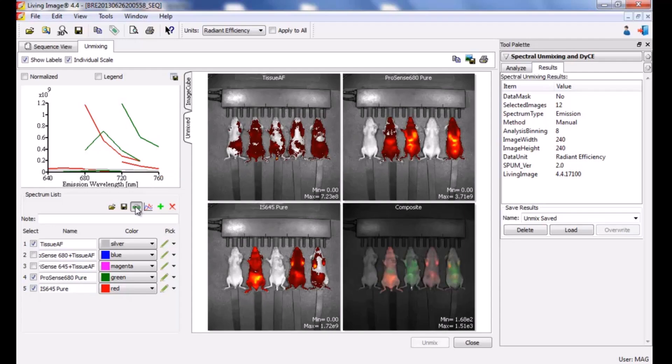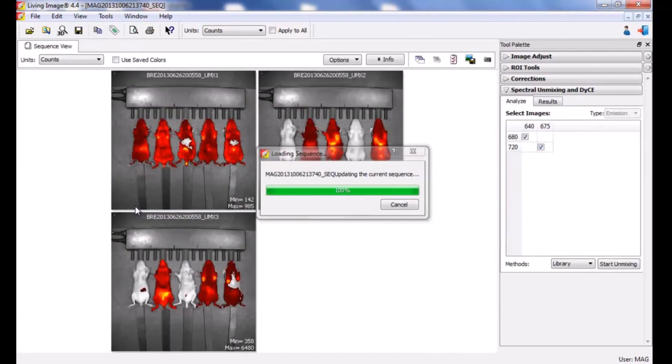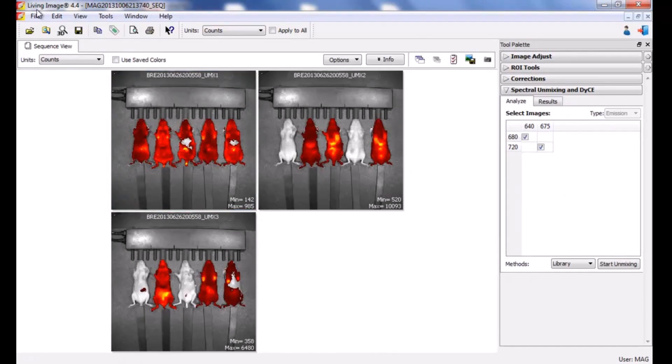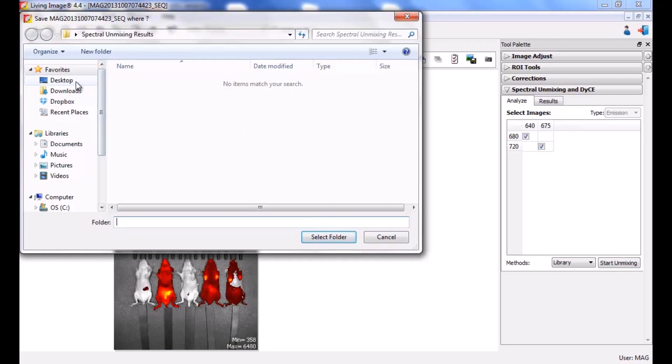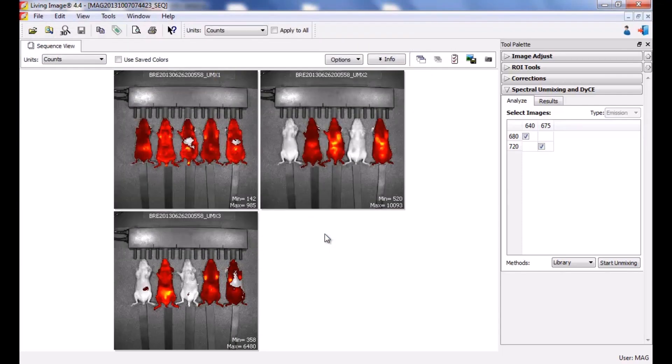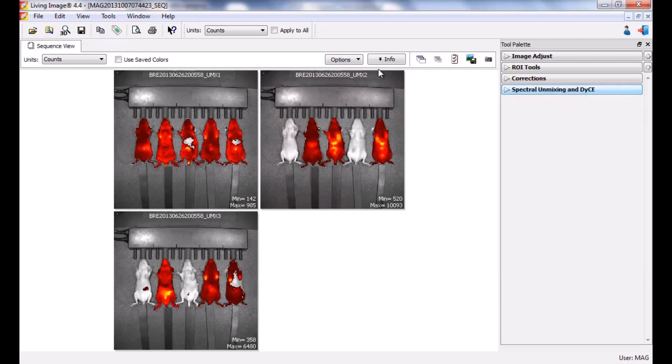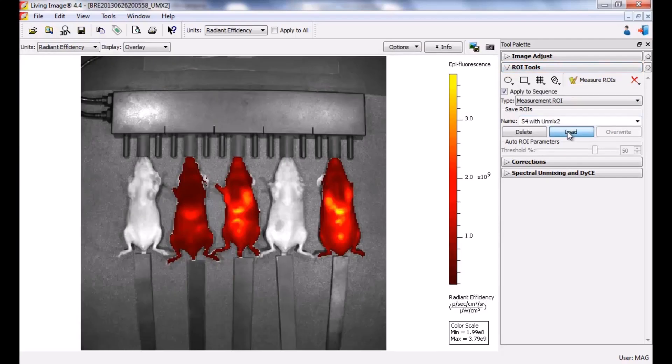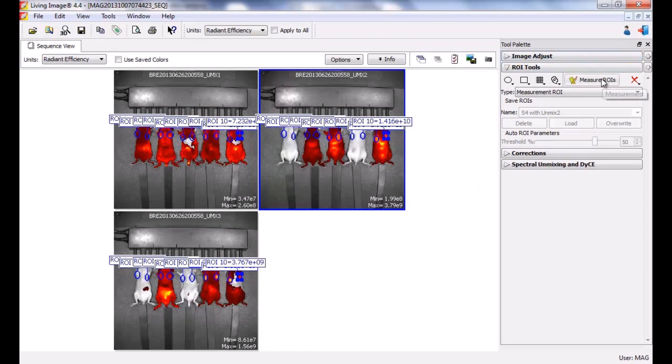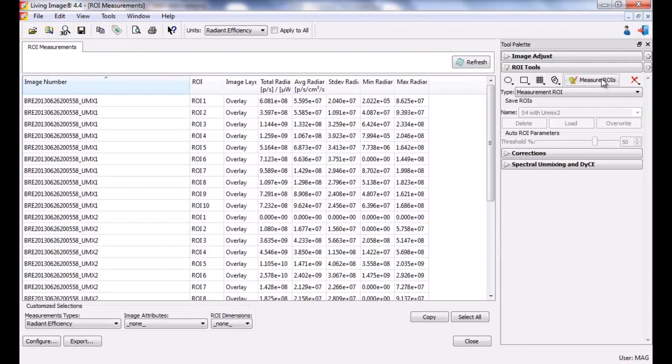To export the results for ease of access later, click the SEQ button. A sequence will be generated which includes the results of all three quantitative images. Click file and save as to store the unmixed images. Data from longitudinal studies can be easily loaded together from the browser using the load as group function described in our previous videos. Analysis on the unmixed images including drawing ROIs and quantifying results can be performed as with any other fluorescent image. We will load pre-saved ROIs from the ROI tools tab. To display the measurements, select the measure ROIs button. Copy and paste the data into Excel.